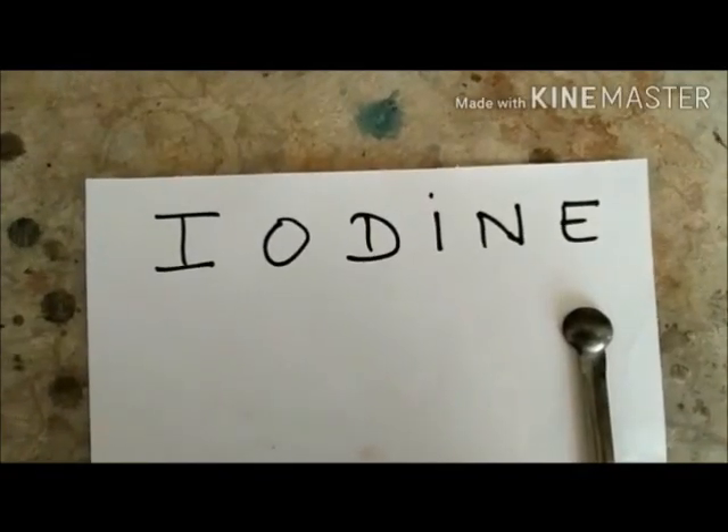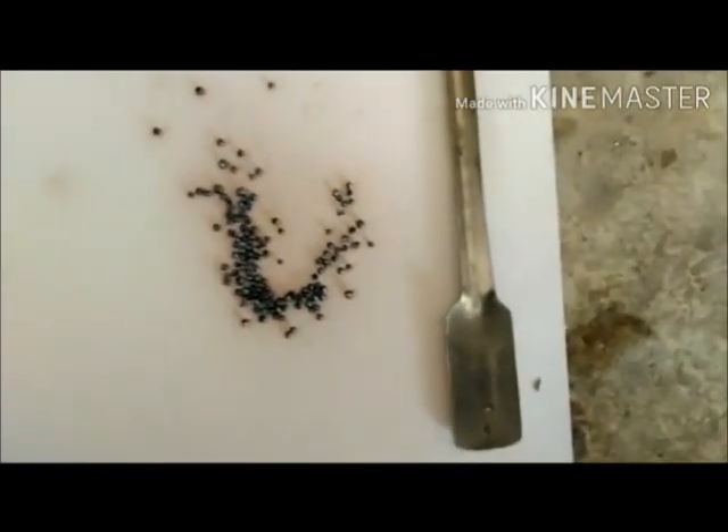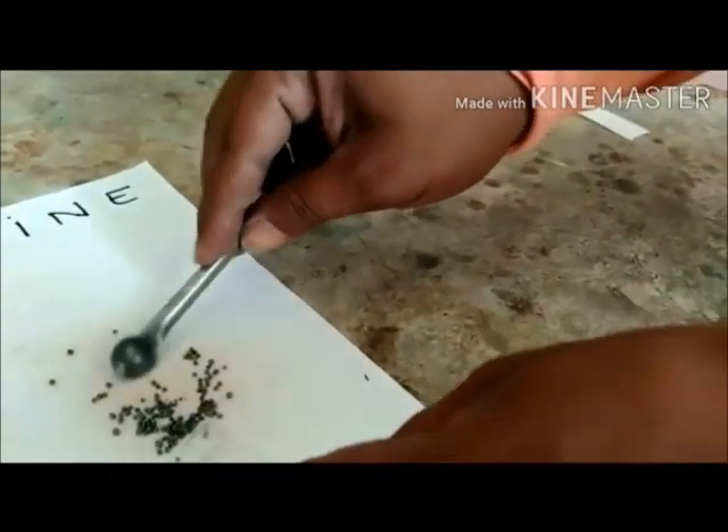In this experiment we have taken iodine crystals. As you can see, these crystals are violet in colour. We also have a test tube, a test tube holder, freshly prepared starch iodide solution, a strip of paper, and a Bunsen burner. We take a test tube and put some crystals of iodine in it.